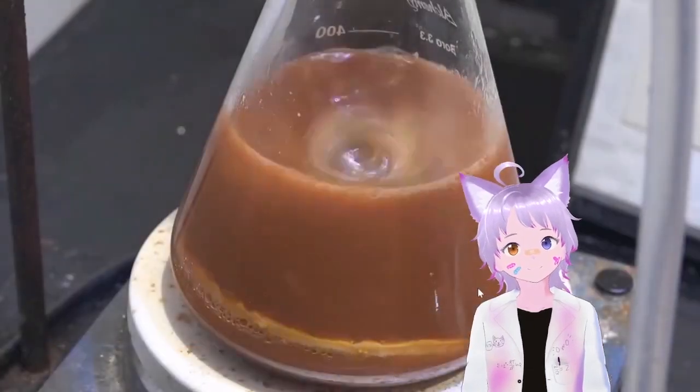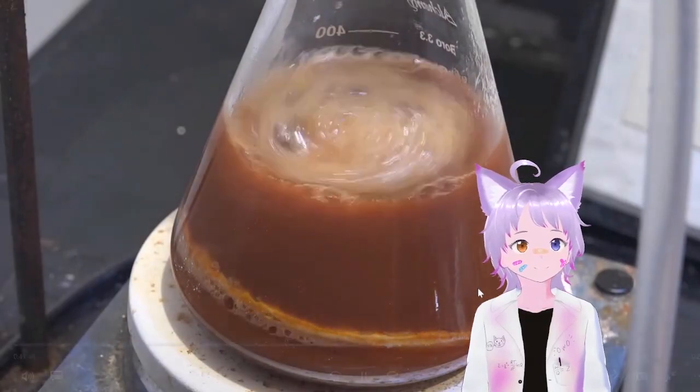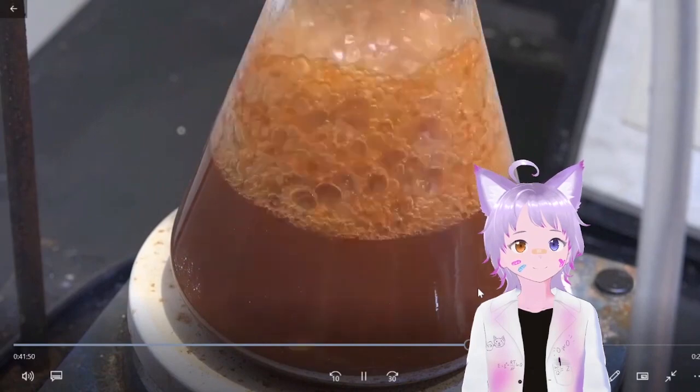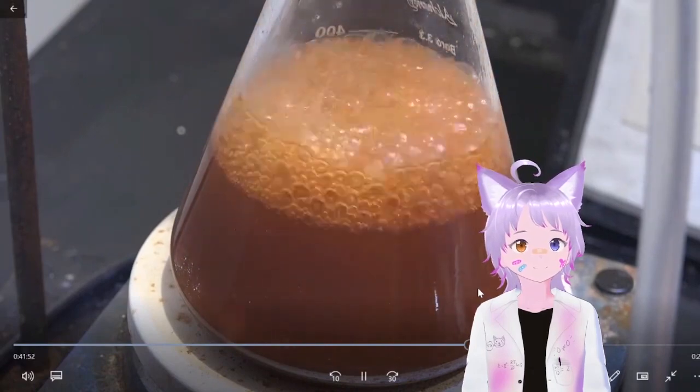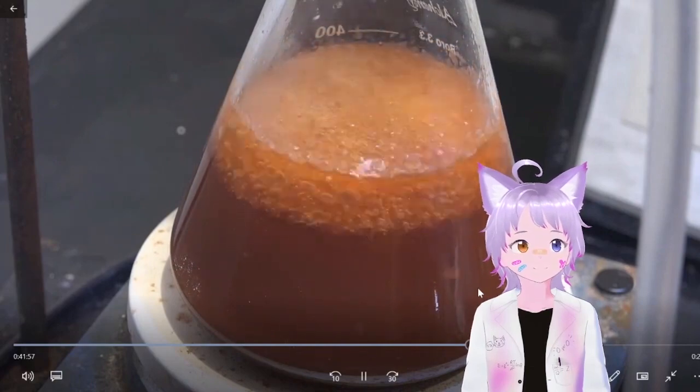Looking back, I forgot to break up the cake of sodium ethoxide first, but eventually with enough stirring, it'll break up on its own. As it runs, it may foam up. Just keep heating and stirring to keep the foam under control. But try to keep it as hot as possible.